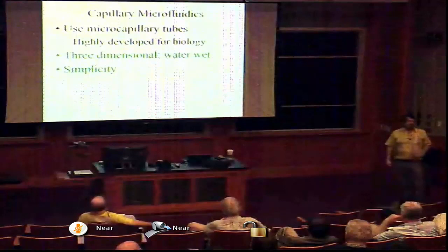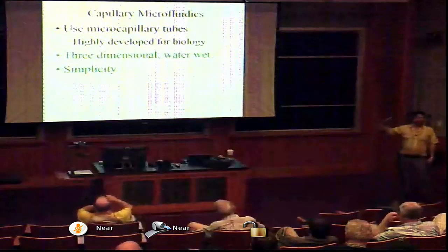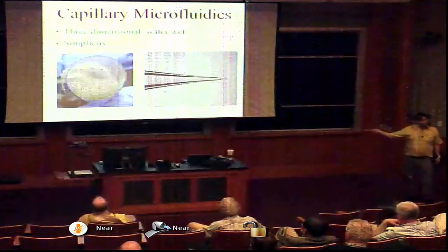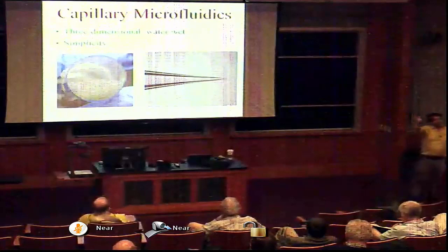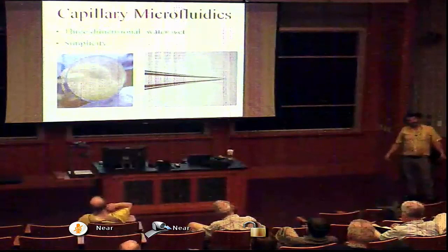So we invented what we call a new kind of microfluidic device. It's actually a very easy device to make. It's made out of capillary tubes. Capillary tubes, you go to a biology department or a chemistry department, they're very, very common. You can get them, you can control them. They look like this. This is a picture of a vial of capillary tubes. These capillary tubes are cylindrical. They're 1 millimeter in outer diameter, about a half a millimeter in inner diameter. Both the inside and outside wall are absolutely well controlled. They're very well defined, perfectly smooth. They're made out of glass, sometimes quartz, but let's say glass.